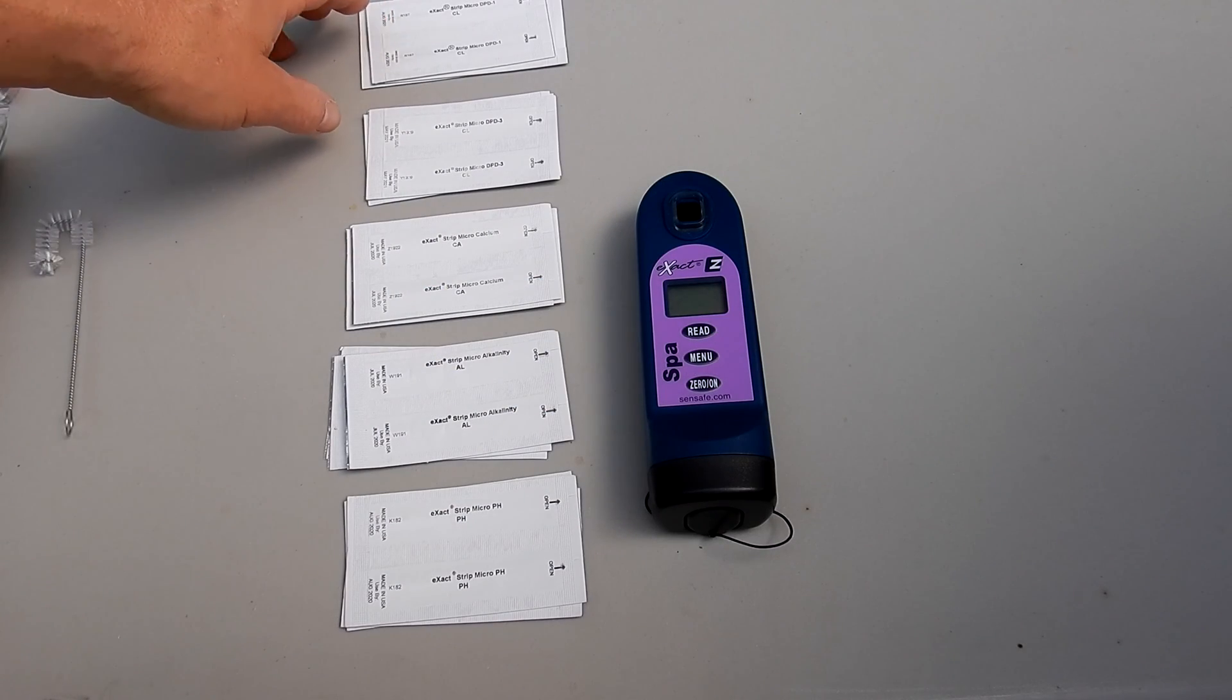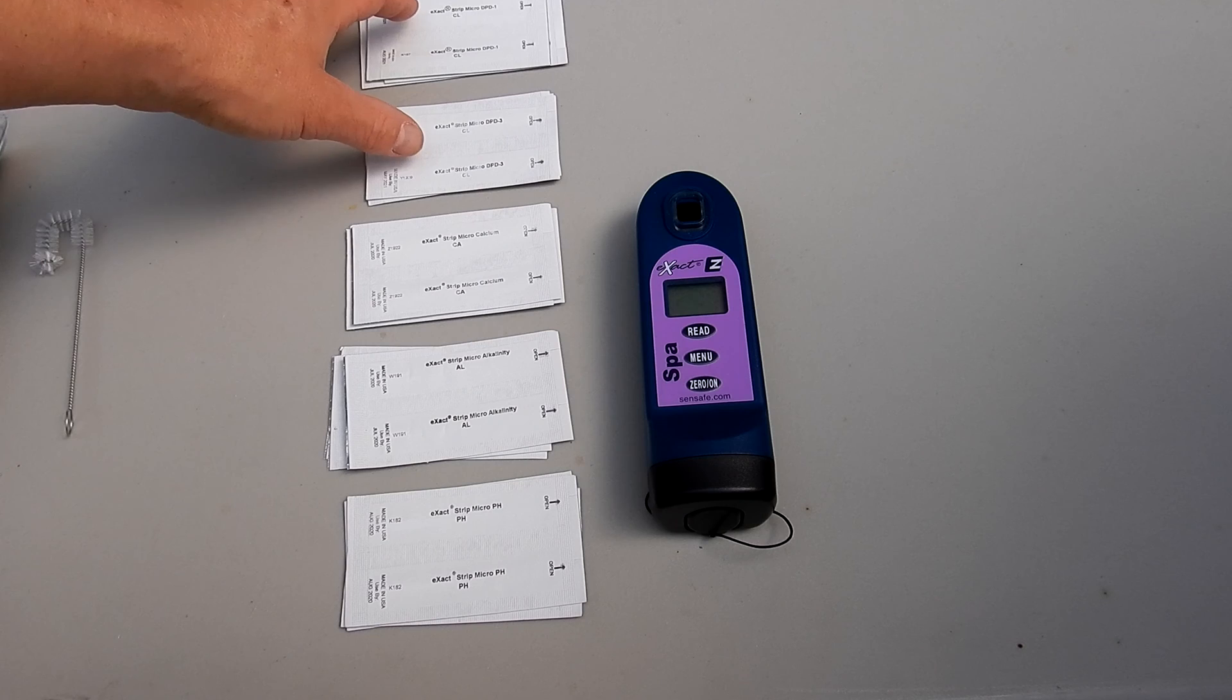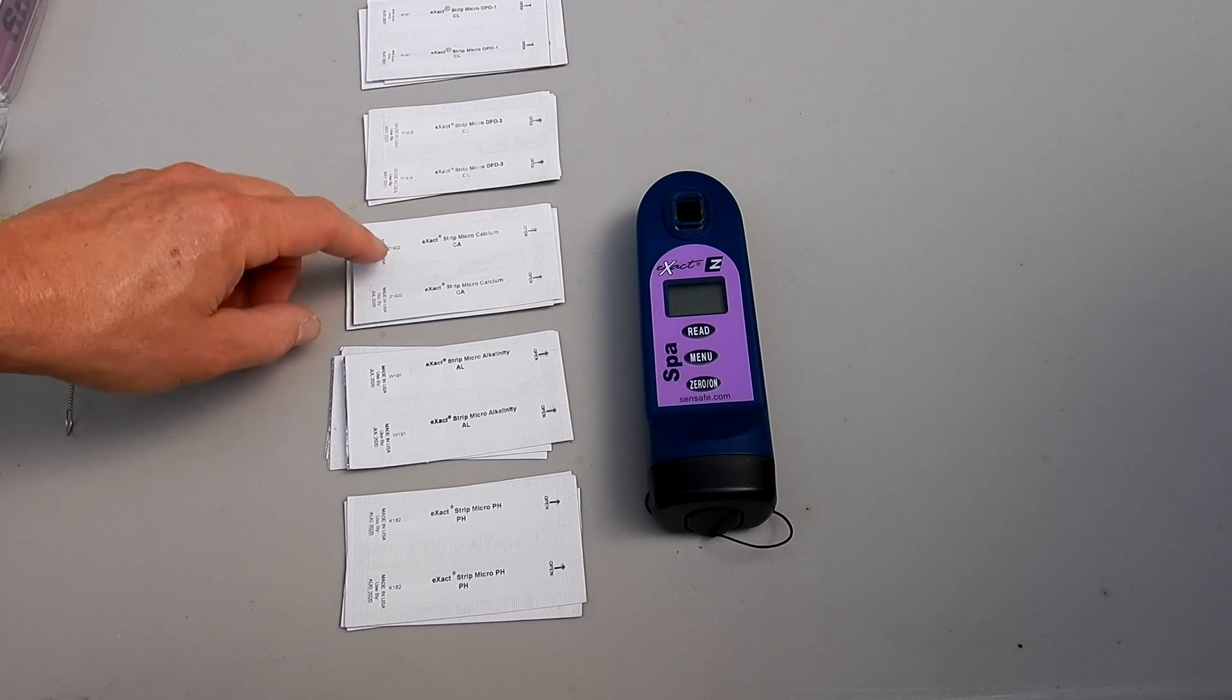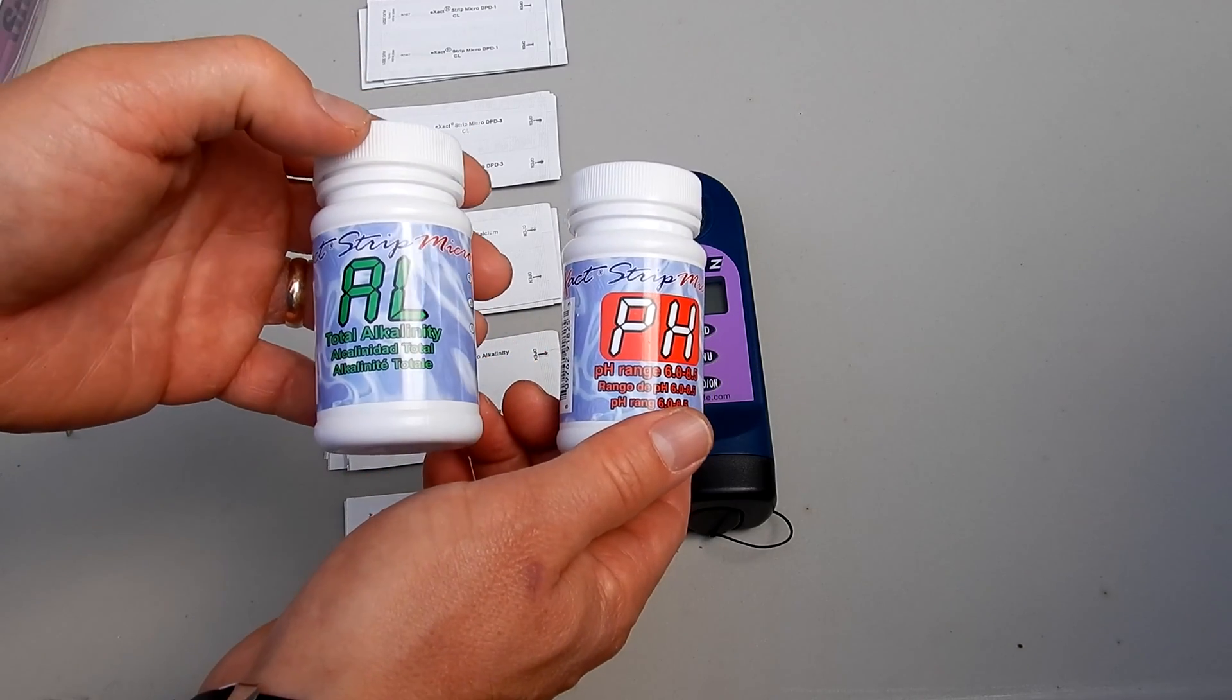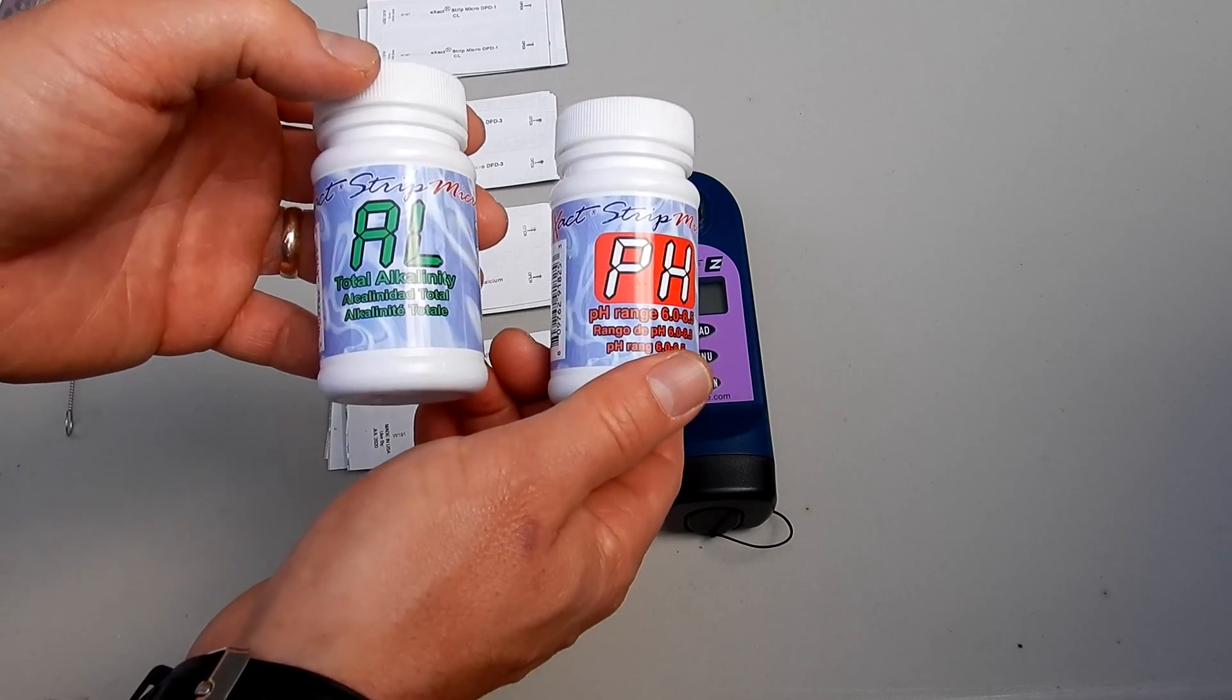Also included are some sample packs of the Exact Strip Micros. These are used to test the free chlorine and total chlorine, calcium hardness, alkalinity, and pH. You can also order more of the Exact Strip Micros for your testing. These are sold separately.